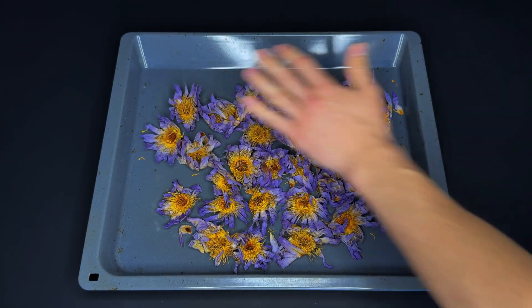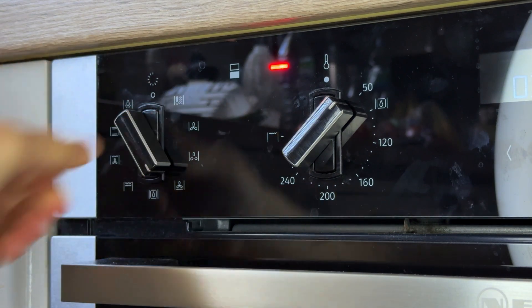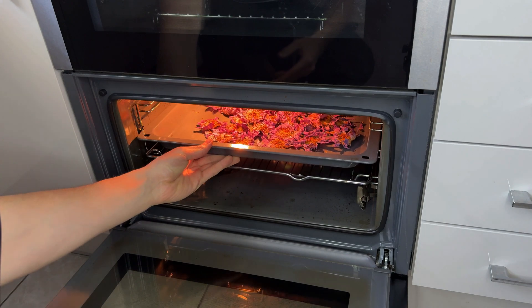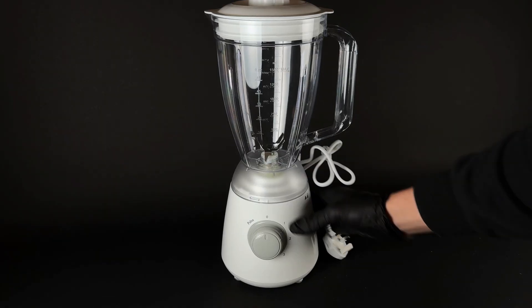I ordered dried flowers, but they turned out to be not quite dry enough. So I'm spreading them out on a baking tray and popping them in the oven for about an hour at 60 degrees Celsius. Now they need to be ground up. For that, I'm using a blender — quick unboxing.